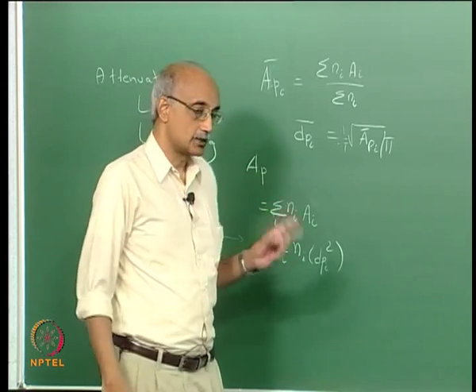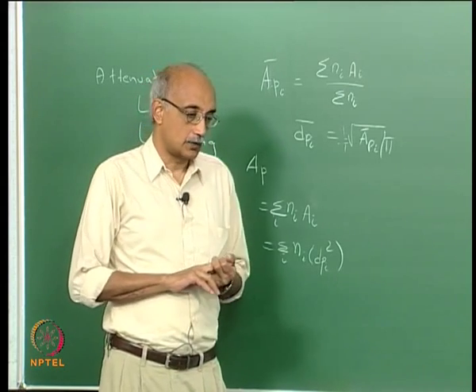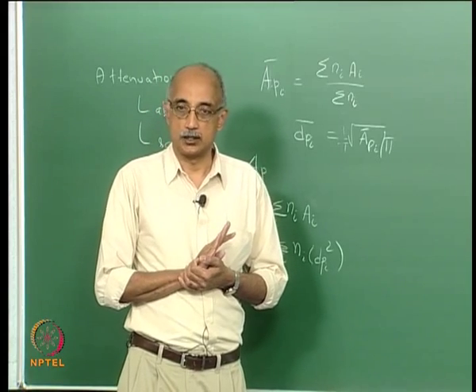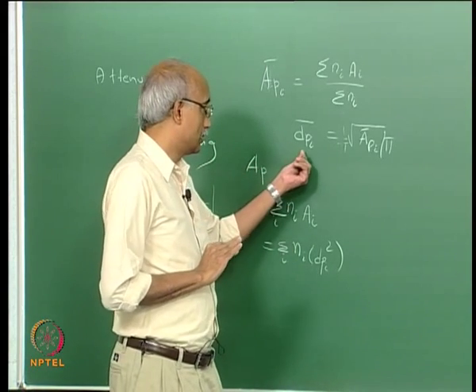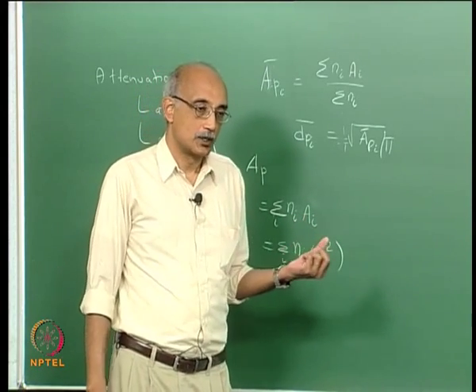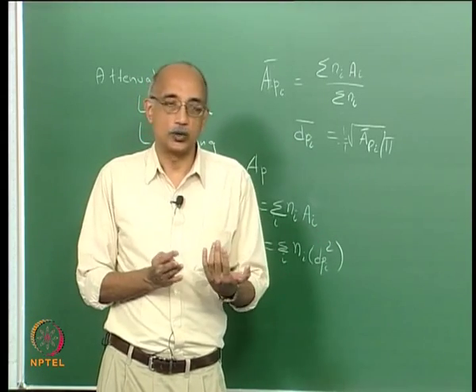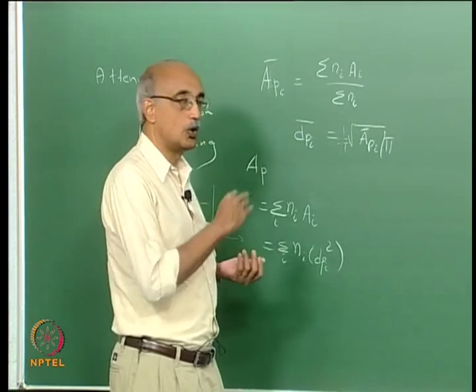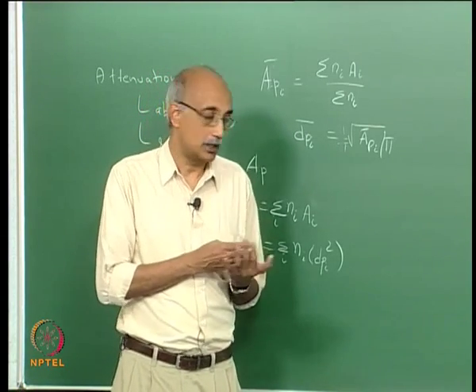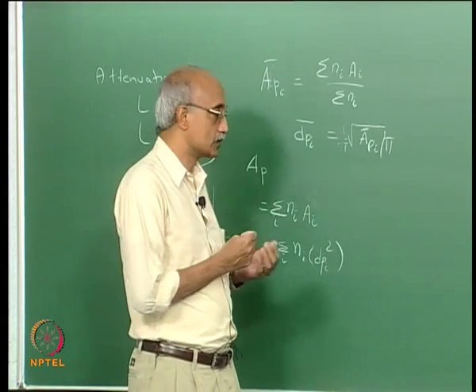The thing you have to realize is twofold. One is that the assumption here is that the particles are roughly spherical in shape. Therefore, the mean particle diameter that you extract from a turbidimeter is not based on single particle inspection. This is obviously looking at the entire powder and looking at its overall light transmission characteristics and estimating the mean size of the particles using that technique. So, that is one limitation.